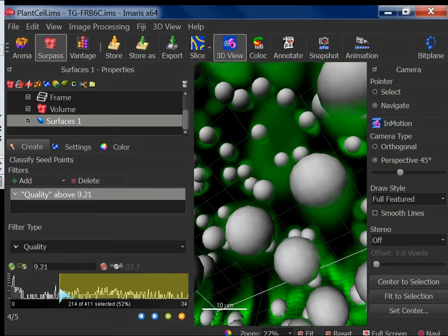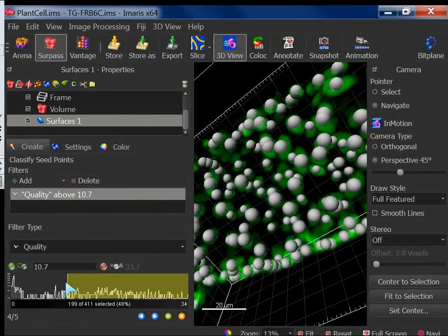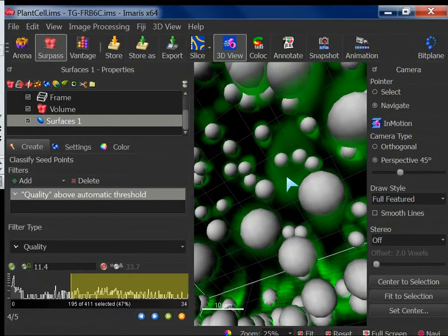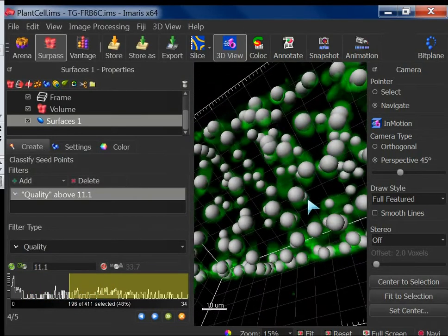Again, you can select the quality of your watershed. It's again the same as a spot object, so depending on what your signal to noise ratio is in your image. Normally one should go for this automatic one. I think it works well most of the time, but not always. Like you see here, there are 2 objects here, and this is missing. So I'm just... well, it's not coming. So maybe we are not looking at it from the right direction.